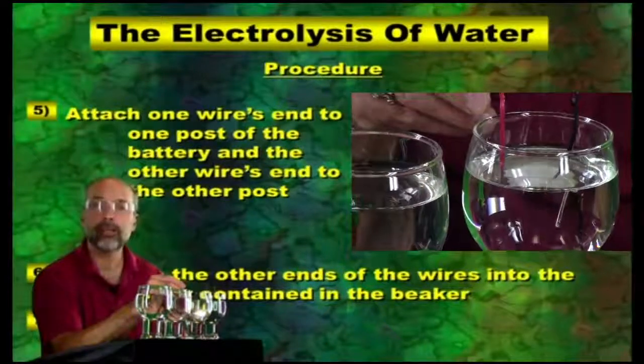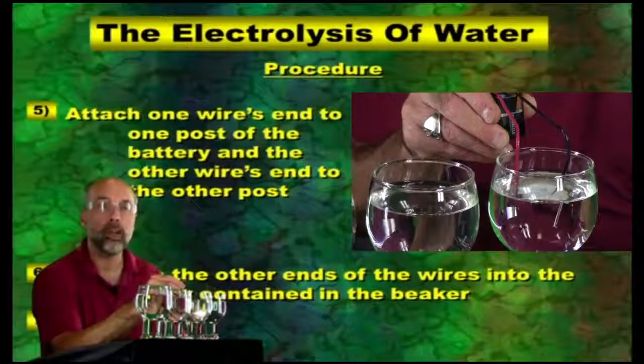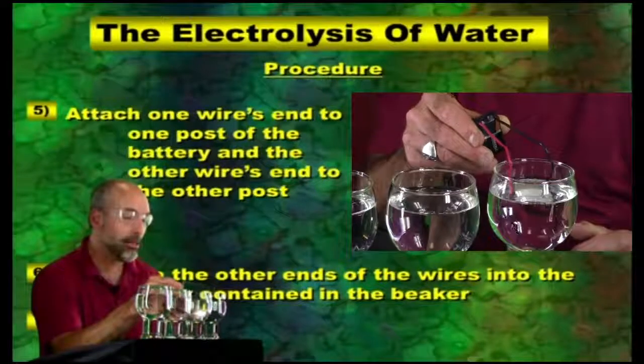Well, should that surprise me? What did we say the formula was for water? H2O. Both of those are nonmetals. They would make a covalent substance. So I look at that and say, there's not much happening here. You might see just a little bit.